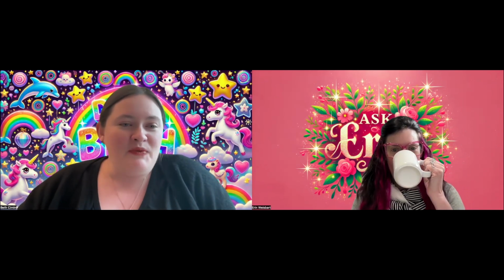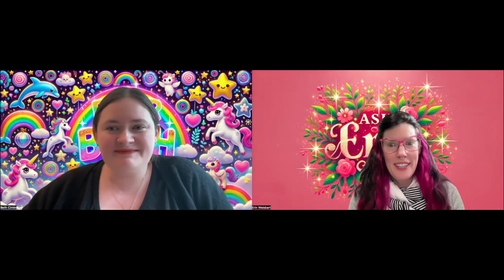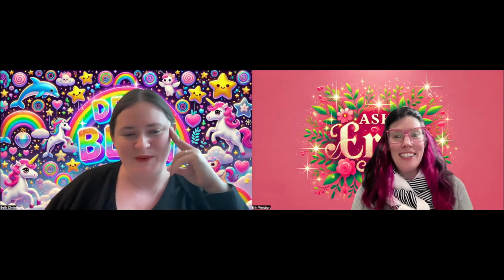I was going to talk today about speckles. How do you feel about that? Ooh, that sounds exciting. I like sparkles. Do we get to do sparkles? Yeah, it can be sparkles. Sure. I love sparkles.